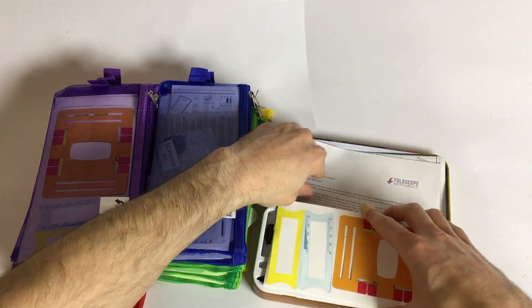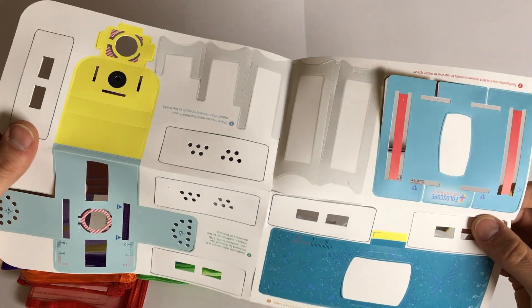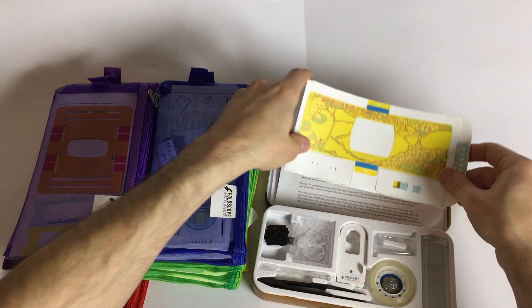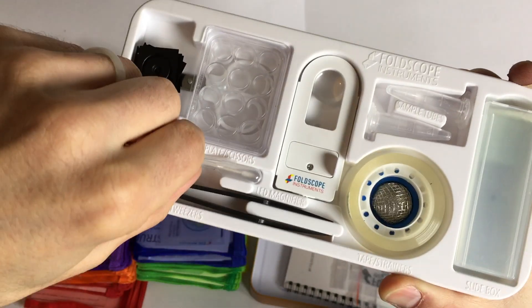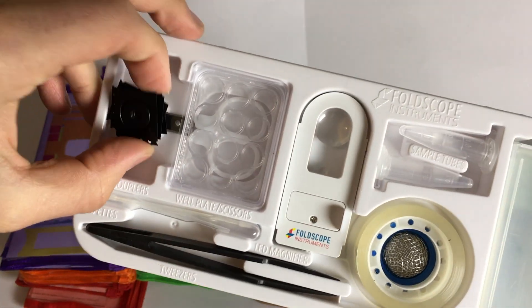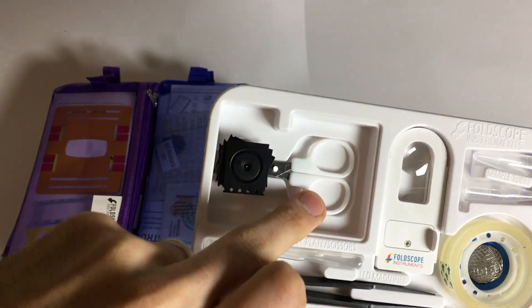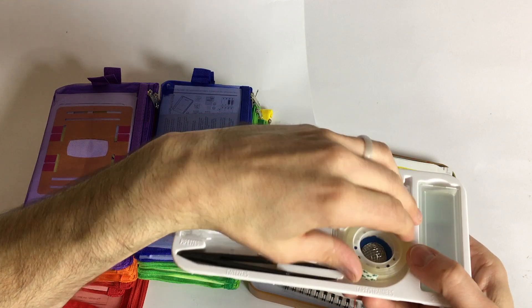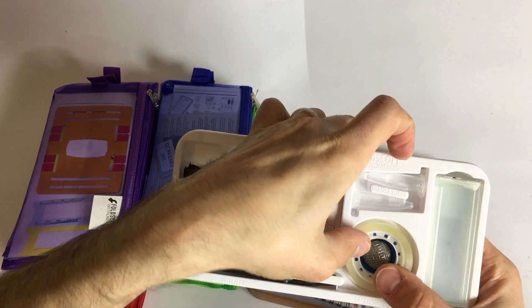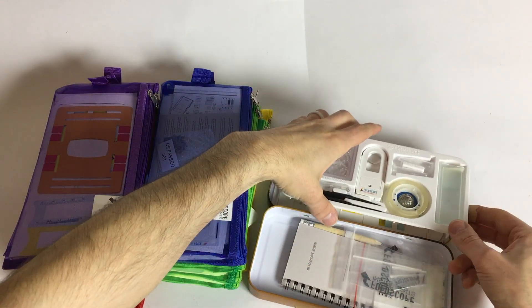Instructions, welcome note. That's the actual microscope — nice. It looks more complicated than I thought it would. And we have here some tweezers, some stuff for saliva and stuff. Something magnetic, something else, little scissors, even a magnifying glass. Actually some sticky tape — however you call it — and some more. Okay, I have to do a lot of reading on this one. These are the glass slides you use to stick your testing stuff between.